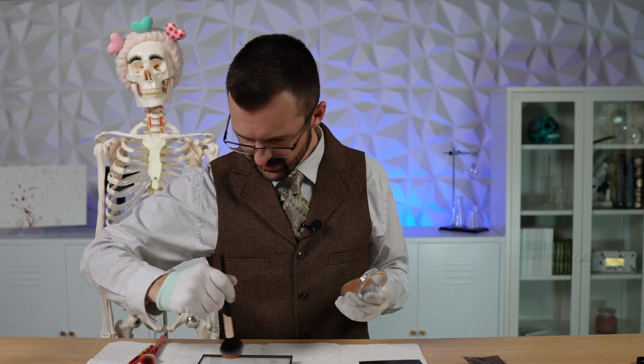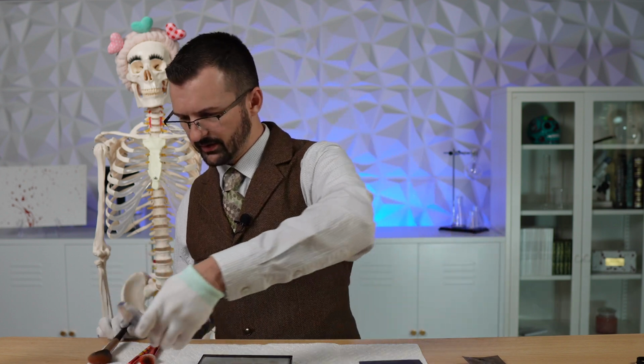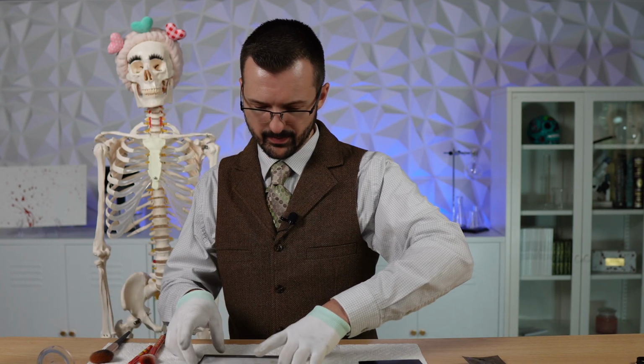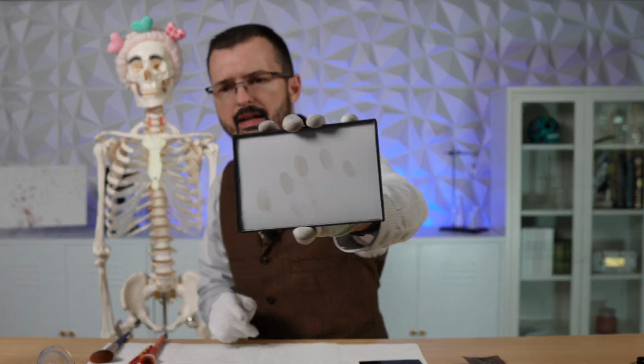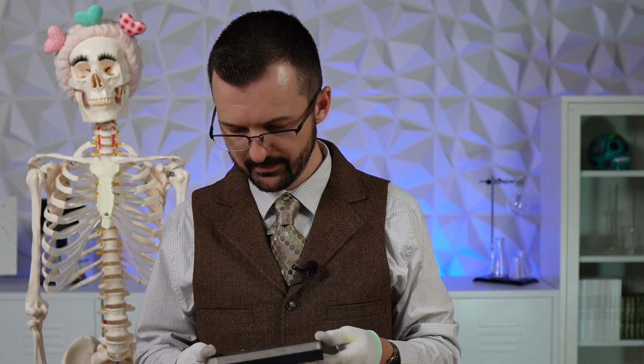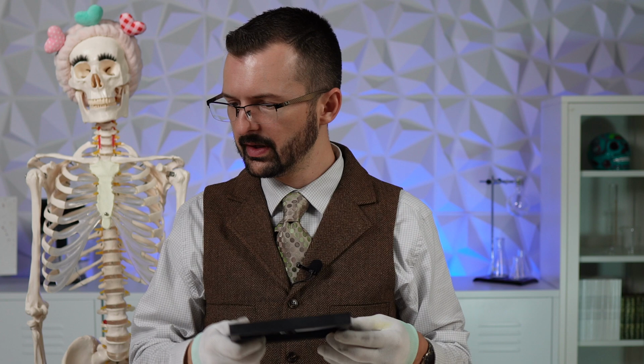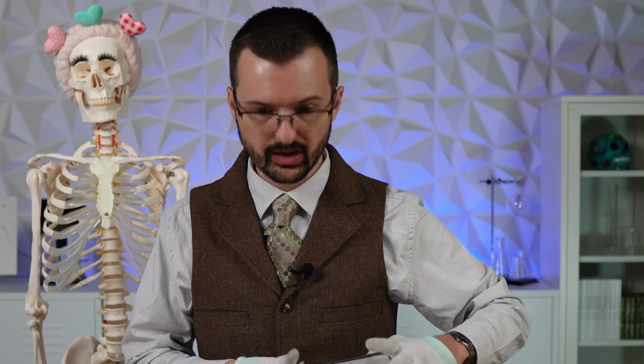Now the contrast isn't that great just because the glass is clear on a white background. So if I had it on a black background, that might look a lot better, but you can see with good shadows. There we go. And we developed some really good fingerprints. Yeah, so then we would lift these off just like we would any other fingerprint and put it on a backing card. We'd take a backing card and we'd take a picture, and that picture is really what I would end up using to compare the fingerprints to any known source or upload it to the NGI database.